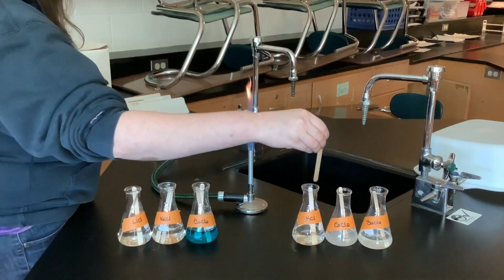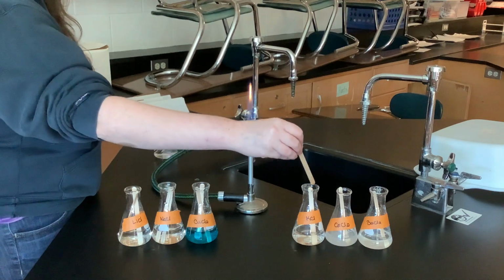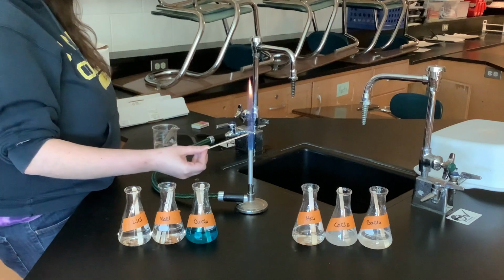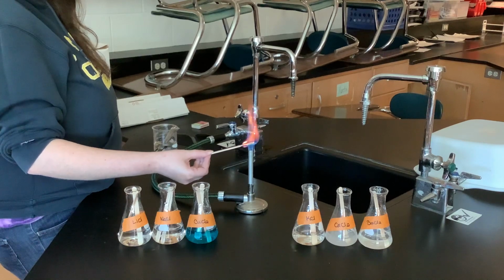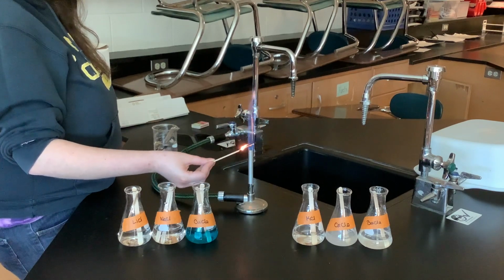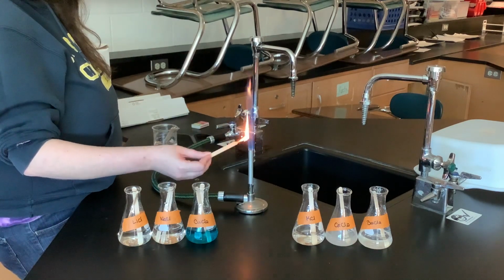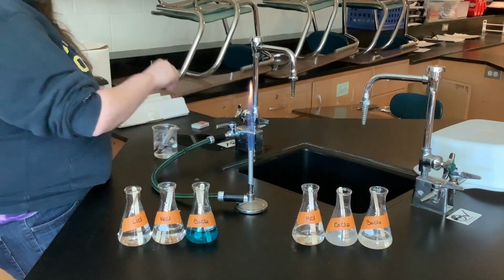All right, the next one we're gonna do is potassium. This one's pretty subtle, okay? As you're watching this one, there's gonna be some orange. We're looking for that other color, like another color that's kind of creeping in there with that orange. Hopefully you can see it on the video. All right, the stick is burning, so that's all we're gonna get.